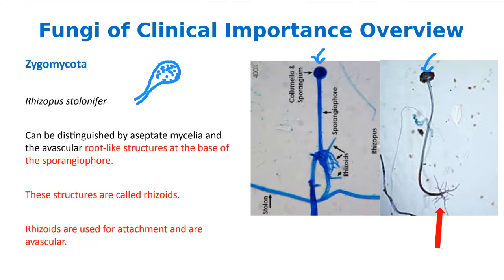Now, while this organism is opportunistic, you have to be immunocompromised to get an infection by Rhizopus, but it's only going to grow. So the mold will only grow where there's a lot of oxygen because they're aerobic, right? But the yeast can be what we call facultatively anaerobic. That means that they prefer oxygen, but they'll grow without it, right? And therefore they could grow anaerobically. But the molds will only grow with oxygen. So they're only going to infect the parts of the body that have a lot of oxygen. Can you name those parts of the body where there's a lot of oxygen?